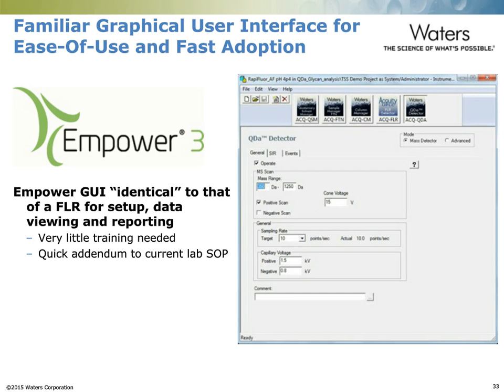With the mass detector, you're defining a starting and an ending mass range. In addition, there are some other parameters such as the cone voltage and capillary voltage that can be adjusted slightly. In our experience, there's very little need to adjust those values, as the instrument is very flat tuning, and it's been designed in that way to be pre-optimized and ready to deploy.